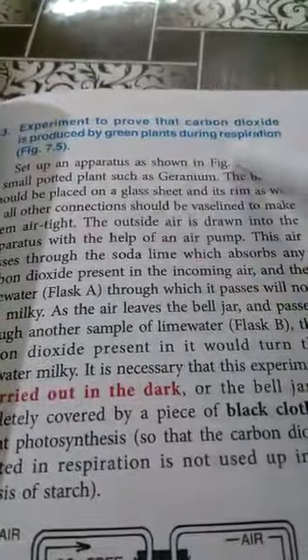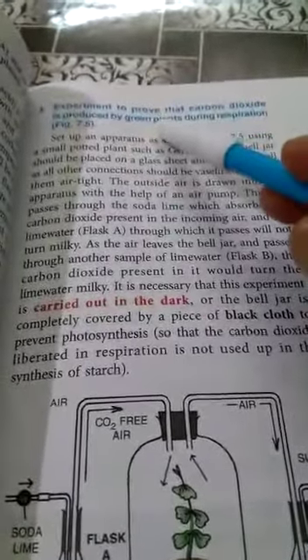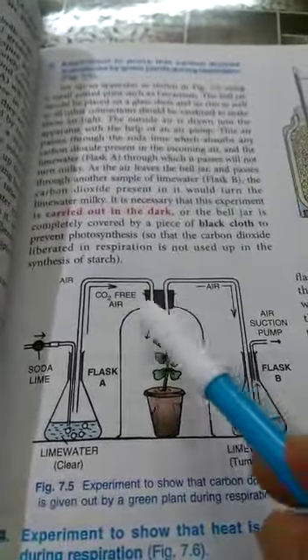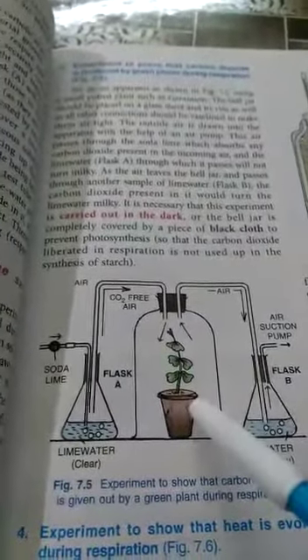Hello students, the next experiment is to prove that carbon dioxide is produced by green plants during respiration. In the previous experiment we studied that germinating seeds release carbon dioxide on respiration. Now we have to study that green plants also release carbon dioxide when they respire. For this we take one bell jar, and in this bell jar we place one potted plant.